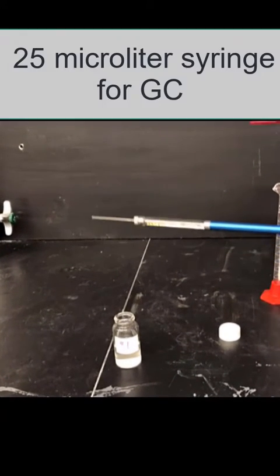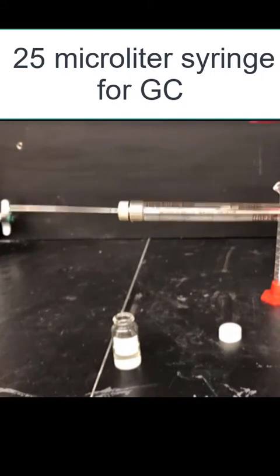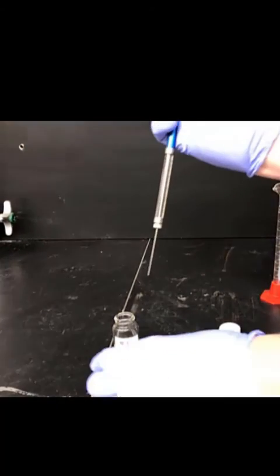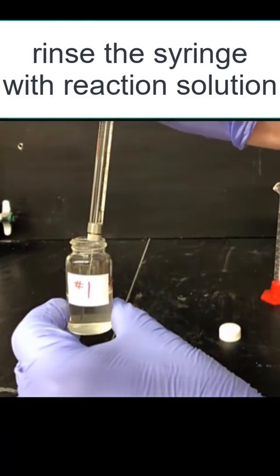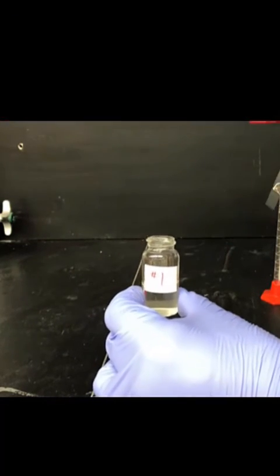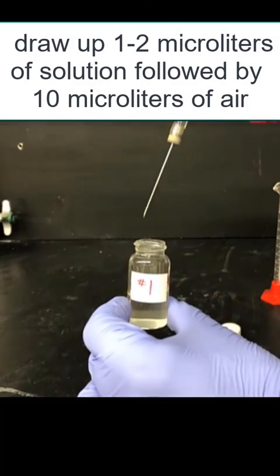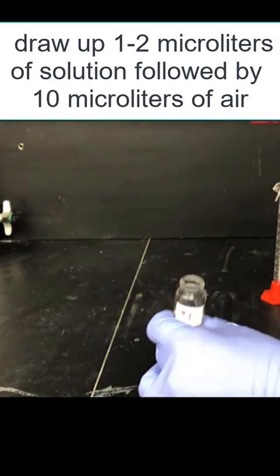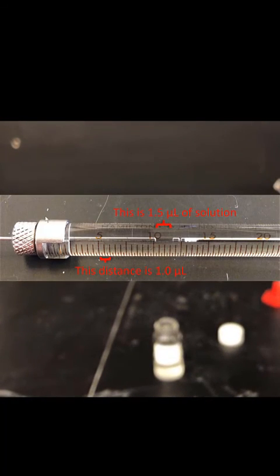To inject solution into the GC, get a 25 microliter syringe and rinse it with acetone to clean it. Next, we're going to rinse the syringe with the reaction solution that we're going to analyze. This fully cleans out the syringe and gets it ready for injection of our material. Next, draw 1 to 2 microliters of the solution that we want to analyze, followed by 10 microliters of air. The air will help us push the solution into the GC's injector port. Here's what it looks like close up.